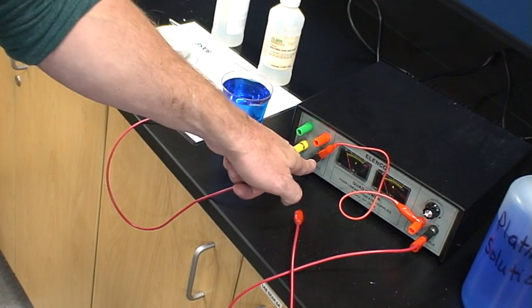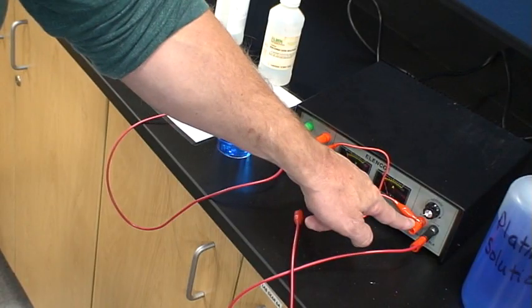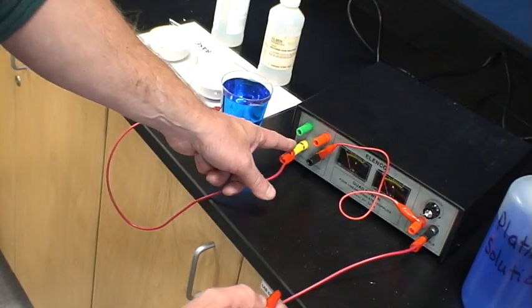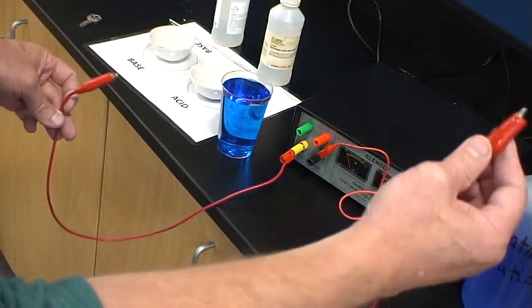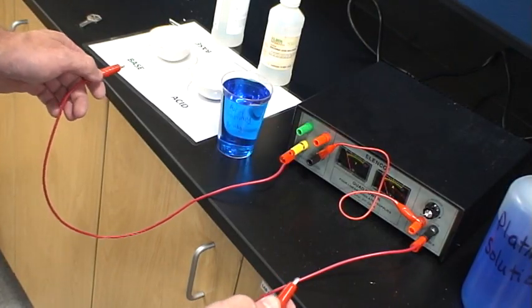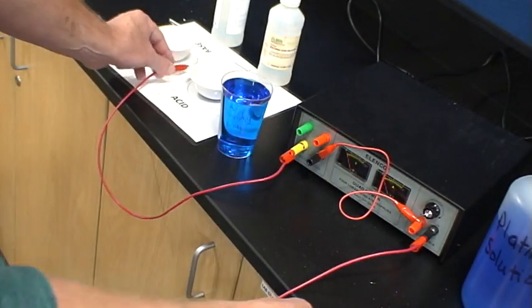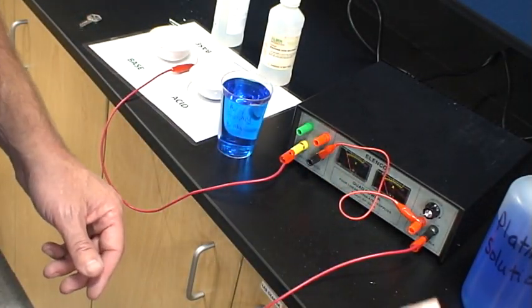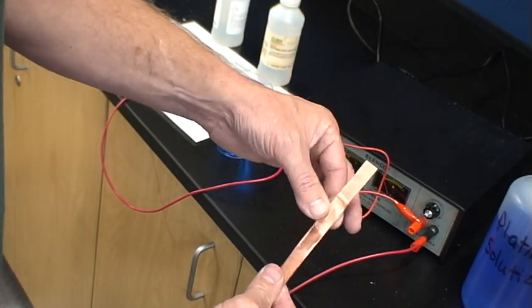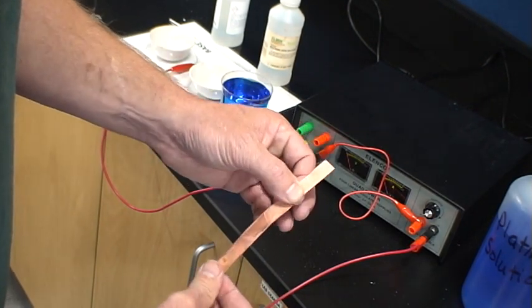Okay, so first of all, to make a parallel circuit here, notice that I do have a bridge between my black and my red in the middle, but then I end up with a black side and a red side over here. I know this is a red cord, but envision this to be a black cord going there, and that's going to help with figuring out what's going on. My black cord is going to be going to a sheet of copper metal. This copper metal is going to serve as one of my reagents here, and that metal sheet is going to be my anode.